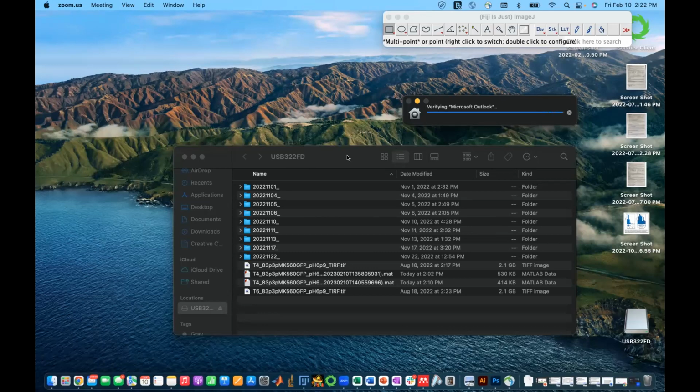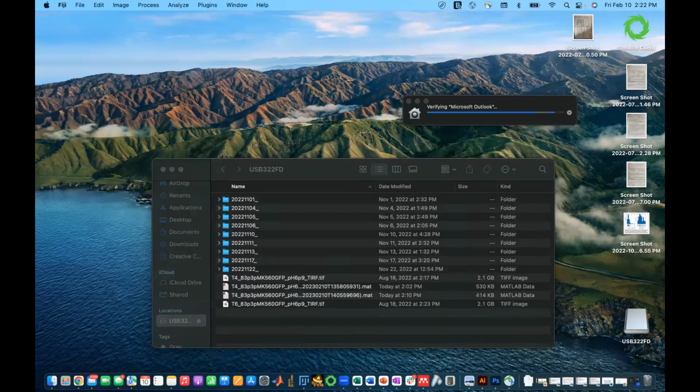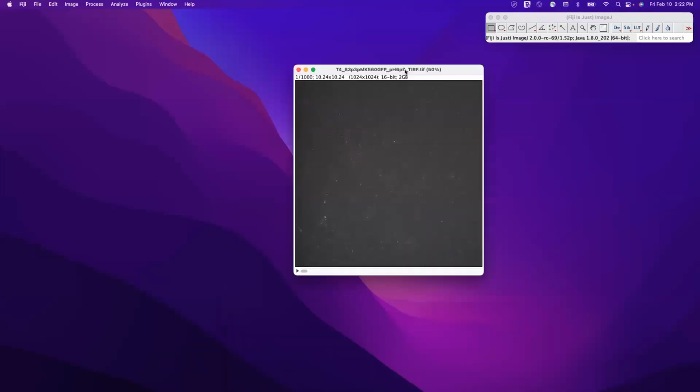So Fiesta and how it works. So first, I'm just gonna do. I should probably put this up here. I'm not gonna see the window. Can you see this? No, it's only that small screen. You can only see this. Yeah. Try this again. So it should be, yeah. And now, what can you see? All right, perfect.